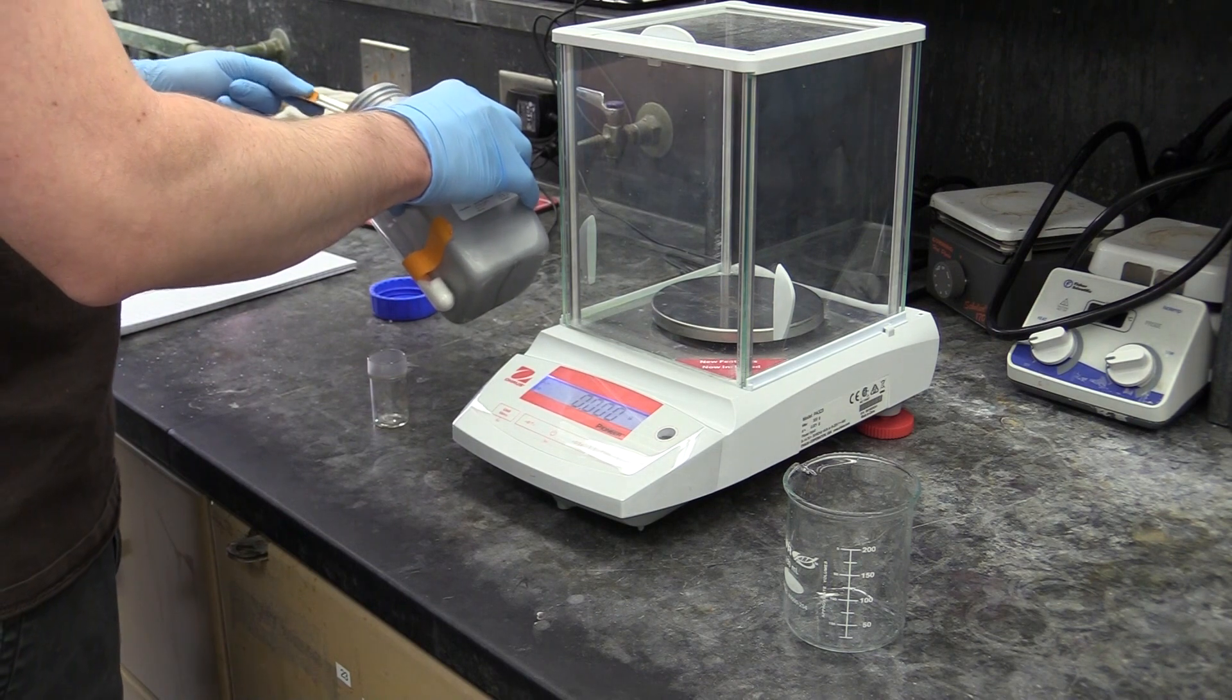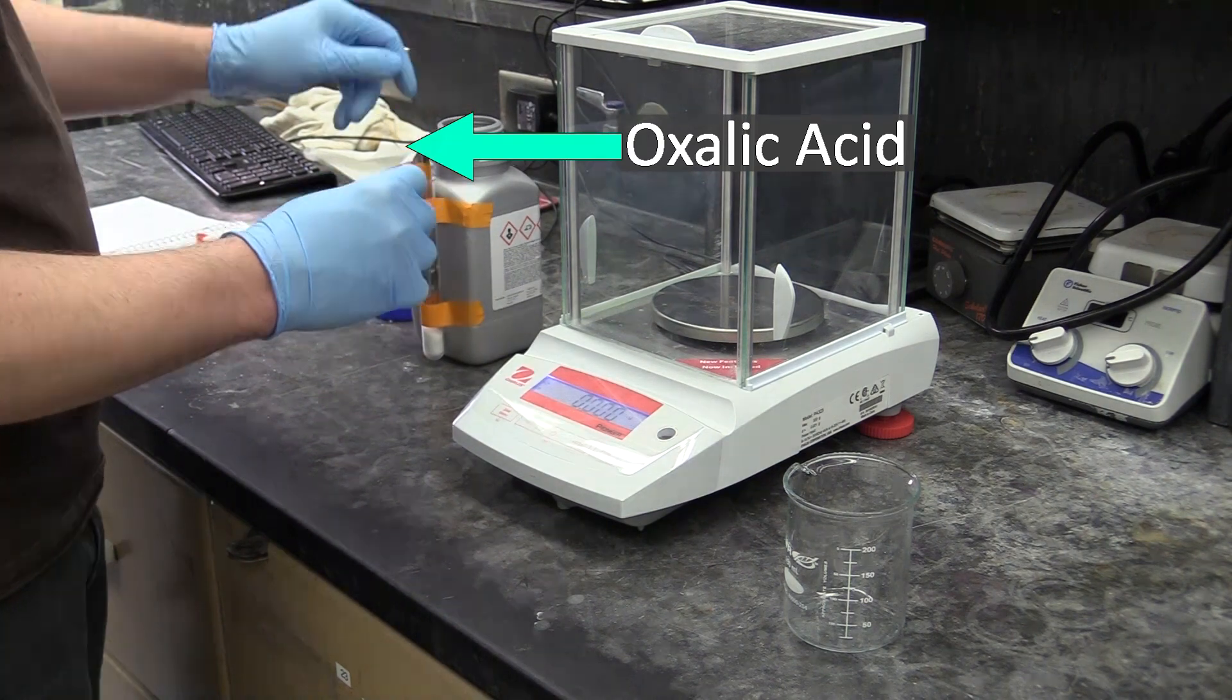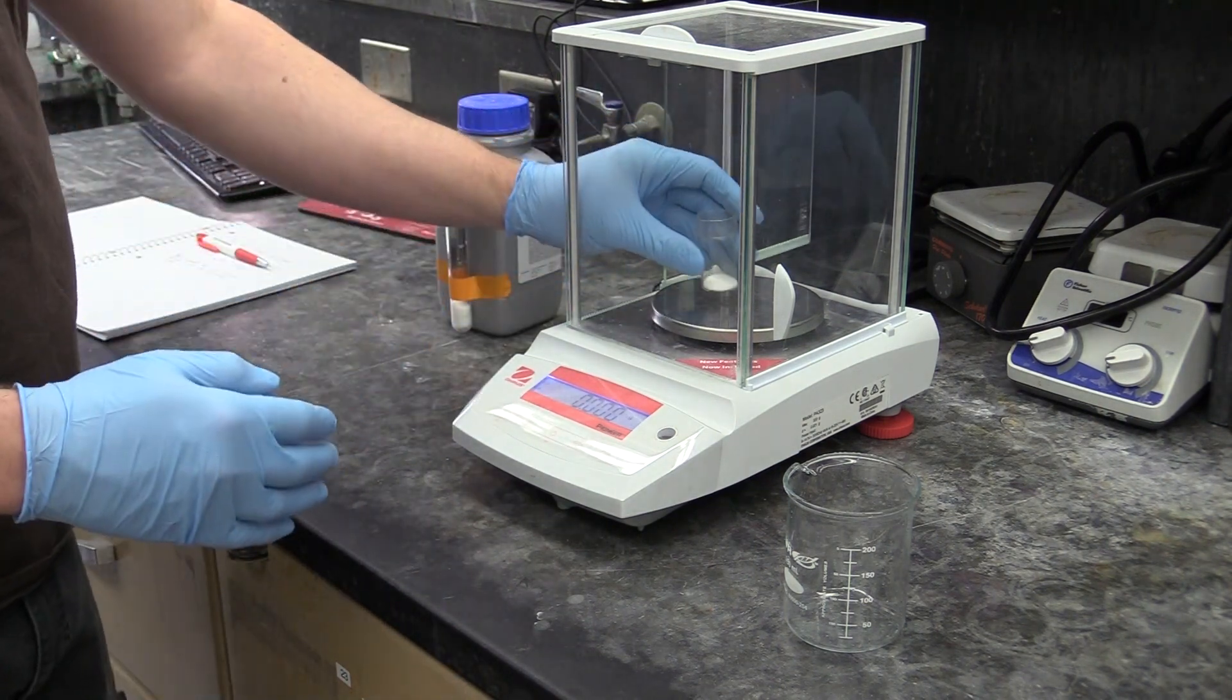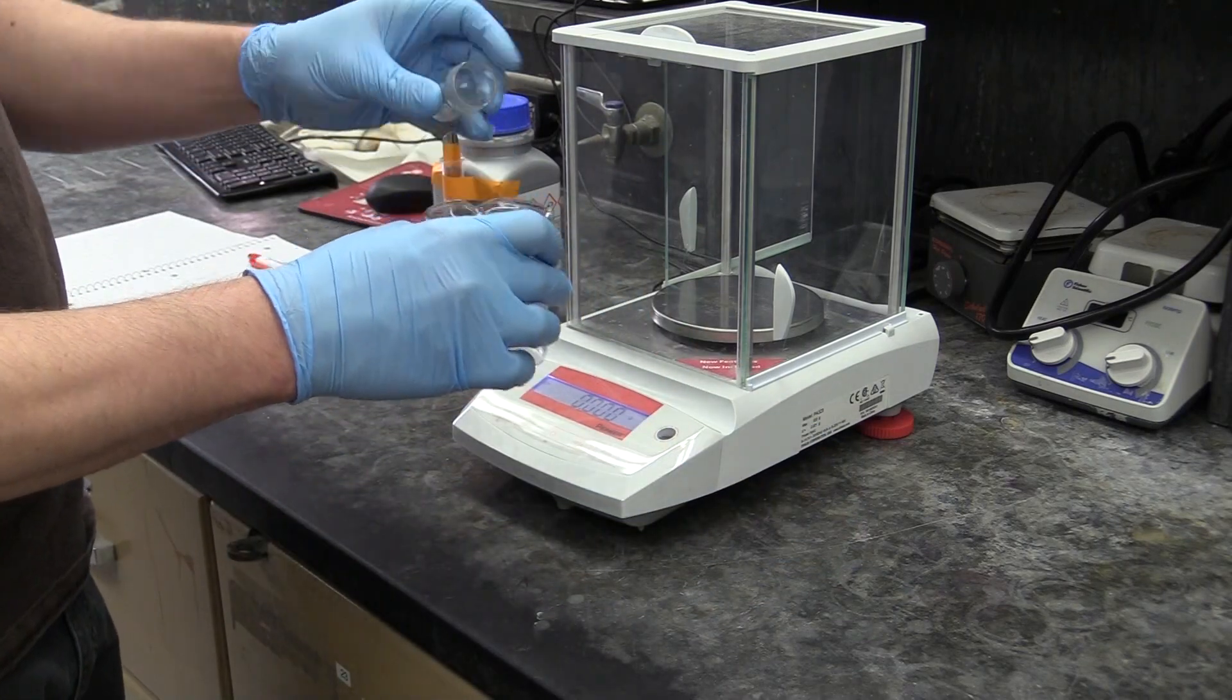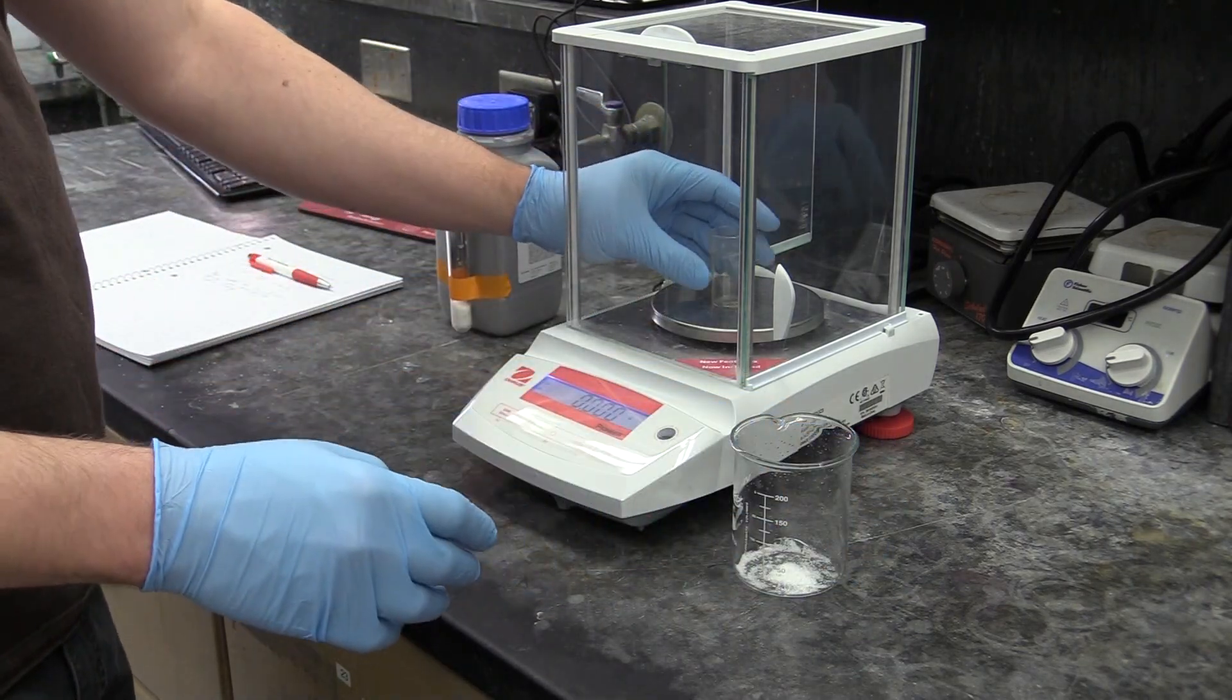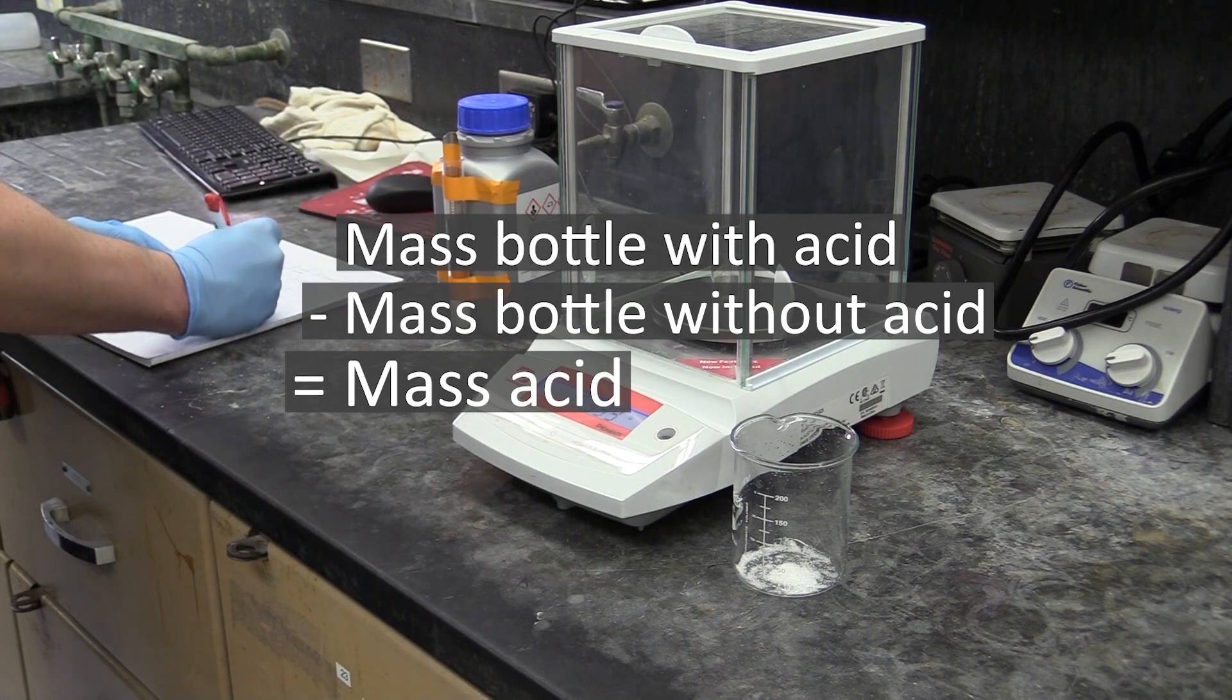First you will make a solution of oxalic acid by putting some solid oxalic acid into a weighing bottle, taking the mass of the bottle with the acid inside, dispensing it into a beaker, and re-weighing your bottle. In your post lab, you can use the two bottle masses to calculate how much acid you've used.